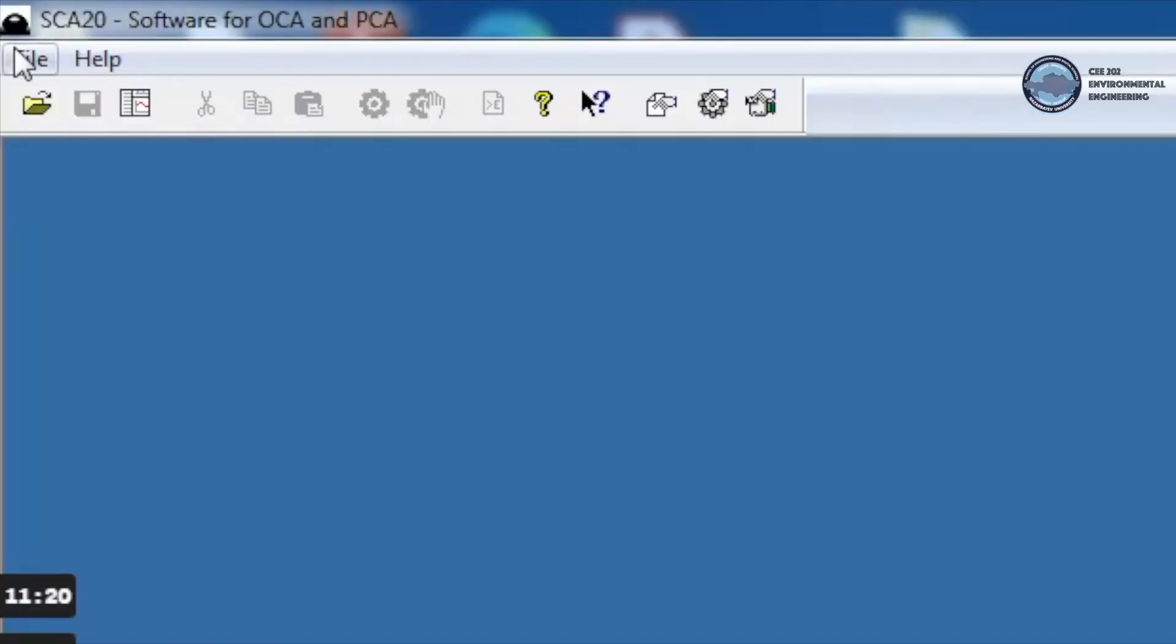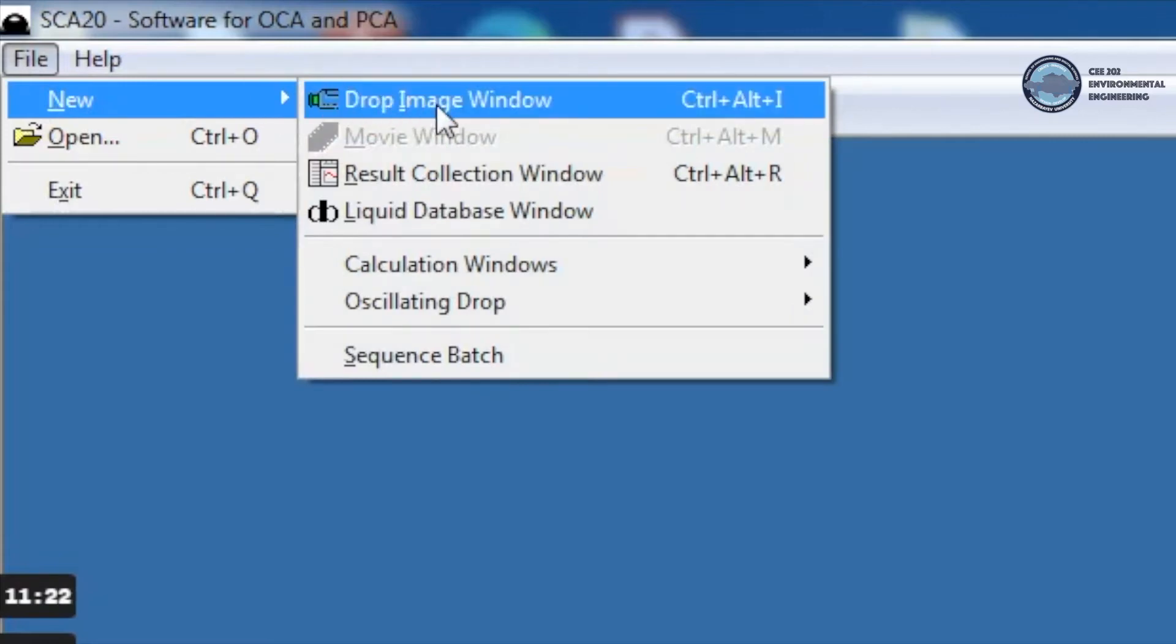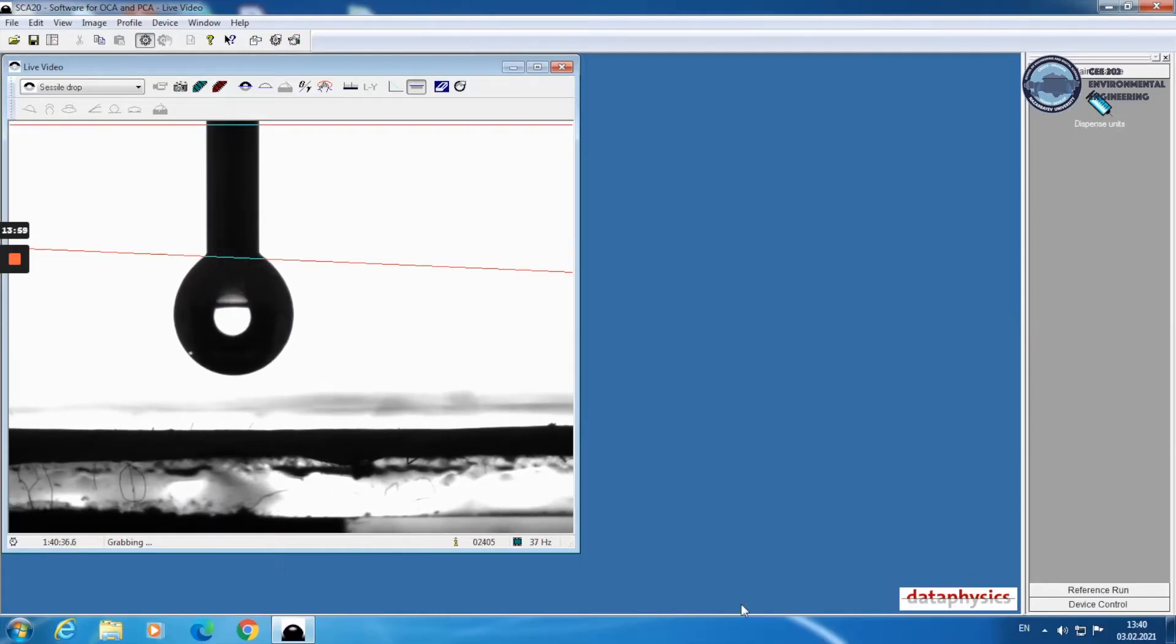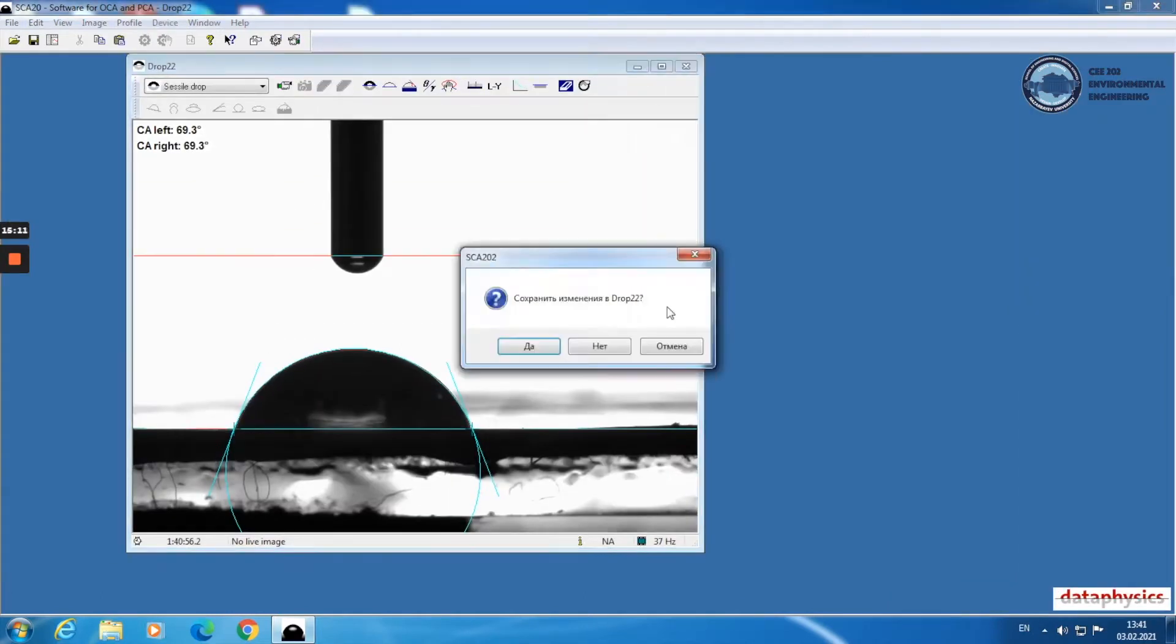To make a new measurement, on menu bar we click on file, select new and drop image window. We will measure contact angle of virgin membrane two more times.